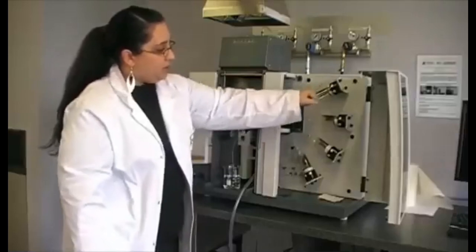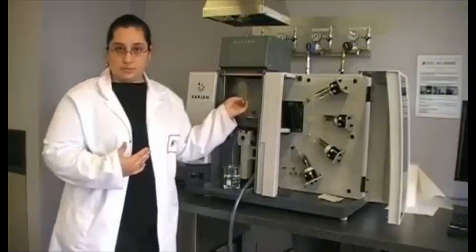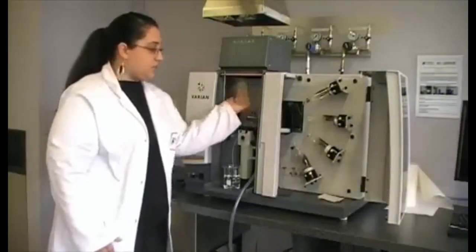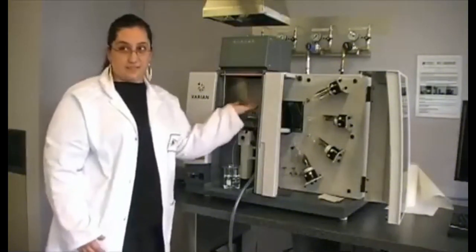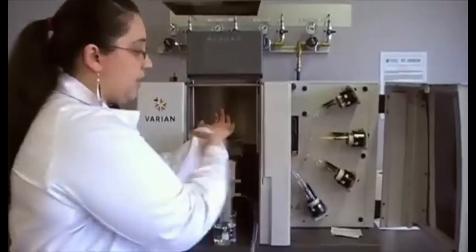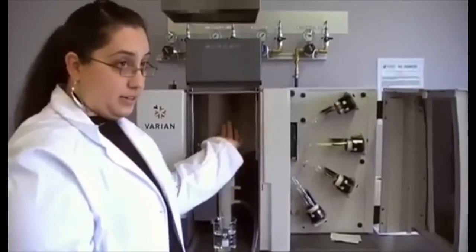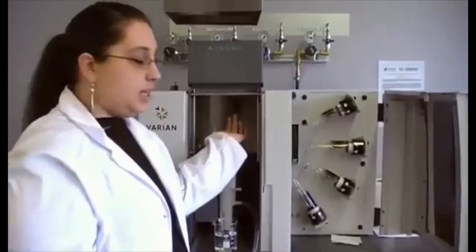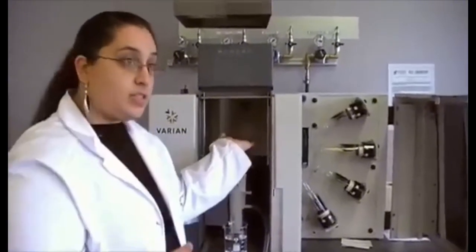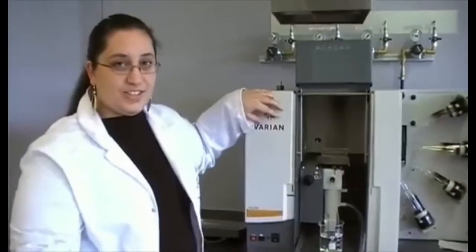So our light will be generated from this lamp at set wavelengths and will then be able to pass through our sample. At the moment what we will have is a range of different atoms and ions burning in our flame. And as we pass the light through, that light is specific for a particular element. So if I was looking for magnesium, a specific wavelength of light is going to be passing through my flame. Any magnesium atoms will be excited, their electrons will be excited to a higher energy level. And then, as they return to their ground state, they'll give off that energy in the form of photons of light.